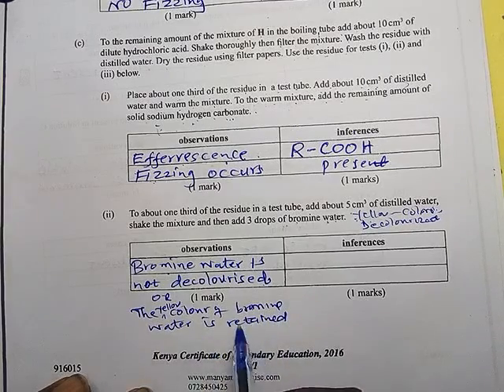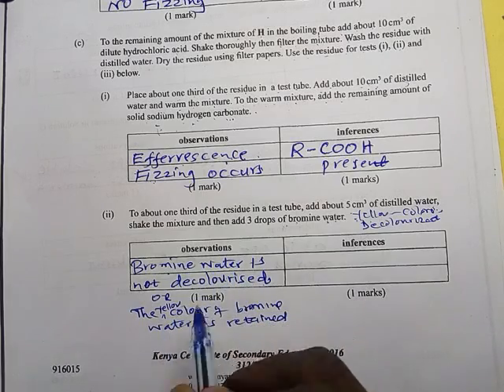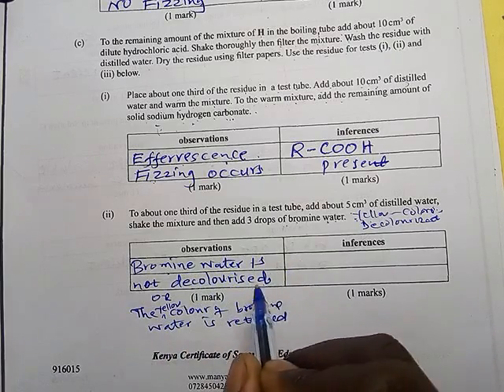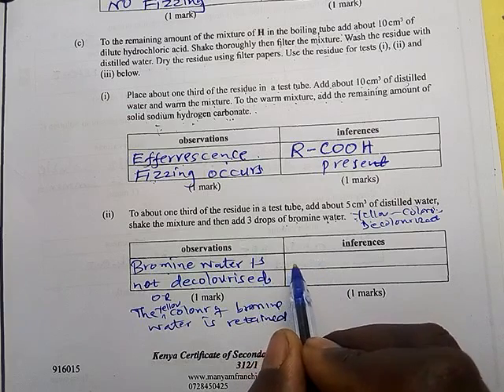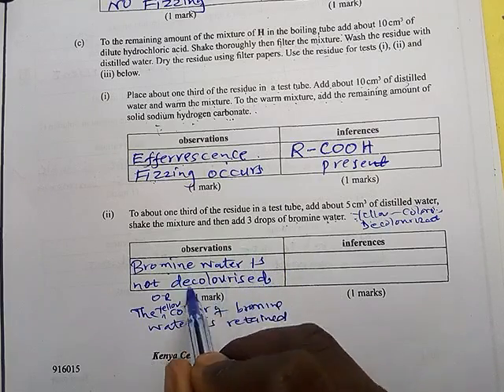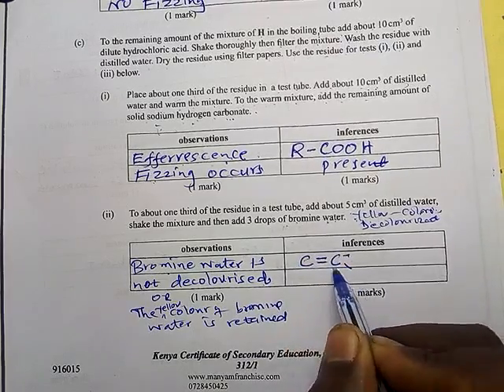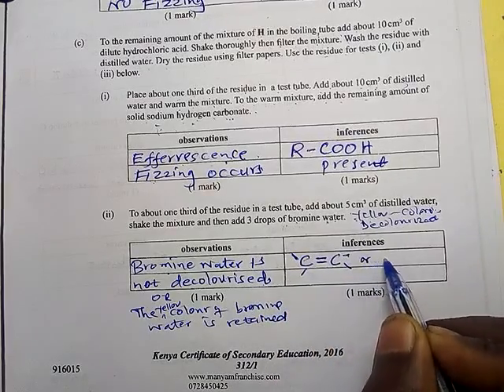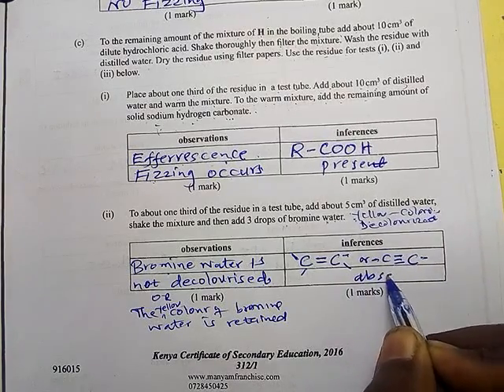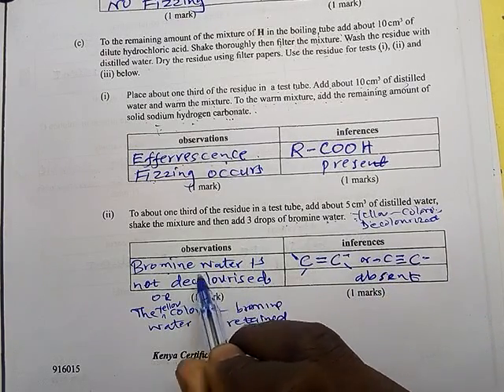Retained, it means it remained yellow. So if that happens, what is the inference? It means that there is no double bond, there is no triple bond, because those unsaturated organic compounds are the ones which decolorize bromine water. So the double bond or the triple bond is absent. If it was present, this one would be decolorized.